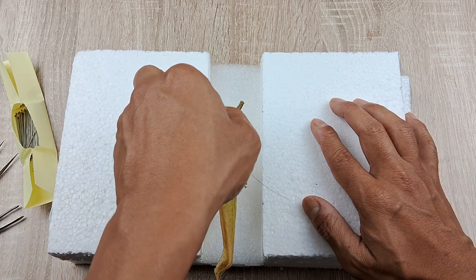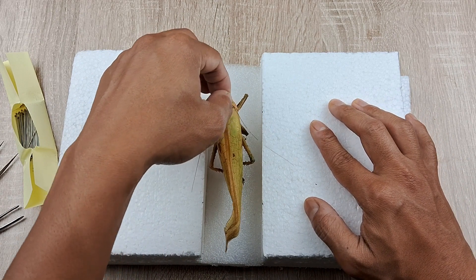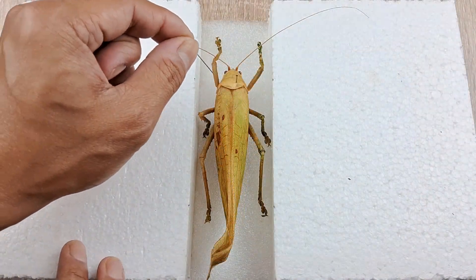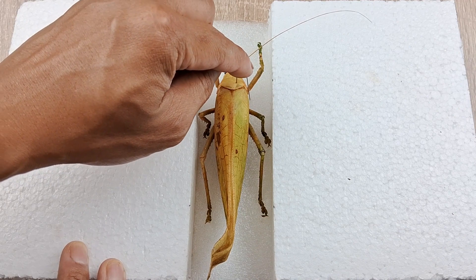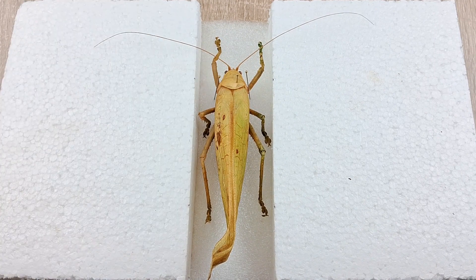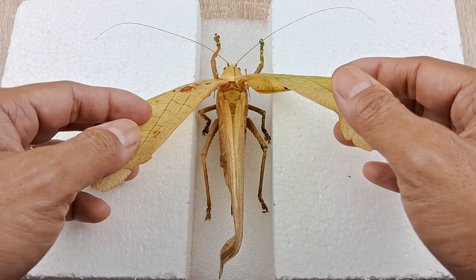Now insert the pin right in the middle of the groove of the spreading board until the wings are in level with the surface of the spreading platform. Next, support the body of the specimen by inserting two pins, one on each side of the thorax, so the body doesn't move around when spreading the wings later. Once that's done, carefully lift the forewings or tegmen and rest them on the platform like so.